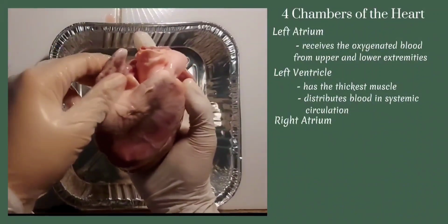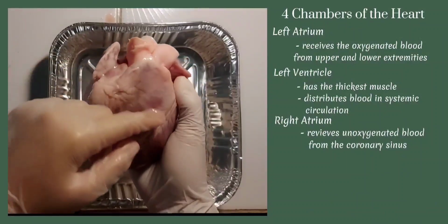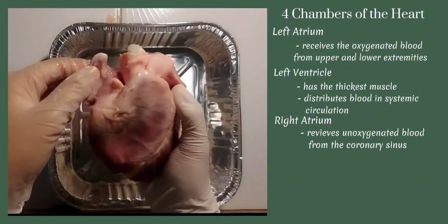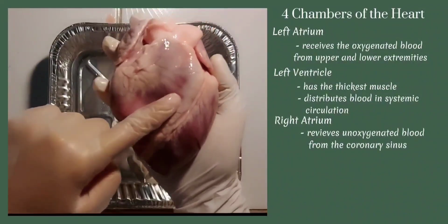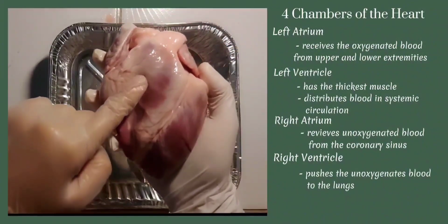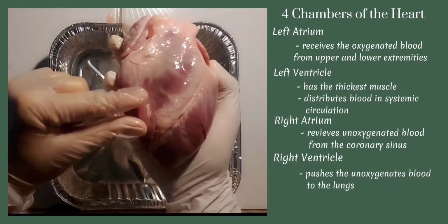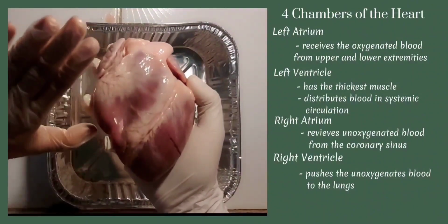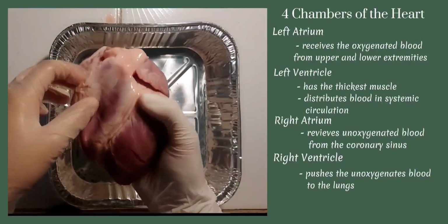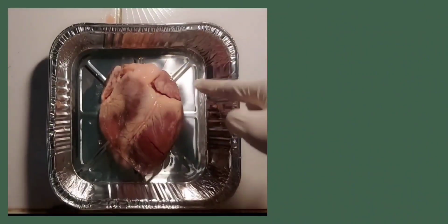This part is the right atrium. This is the part where it receives the unoxygenated blood given by the vessel called the coronary sinus. The blood is given by the superior and inferior vena cava. And just below the right atrium is the right ventricle. This is the part where it pushes the unoxygenated blood to the lungs. We will also observe later that the muscle on this ventricle is less large than the left ventricle because it only pushes the blood to its closest organ, which is the lungs, and therefore does not need much work and muscle.